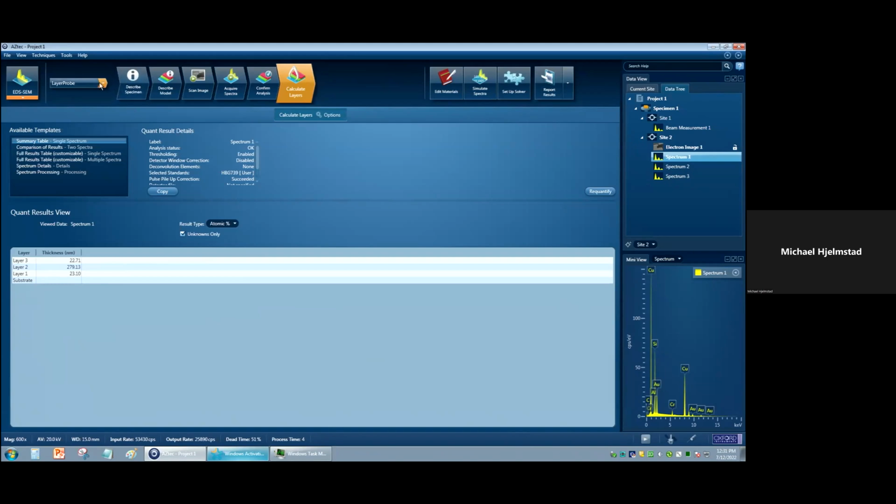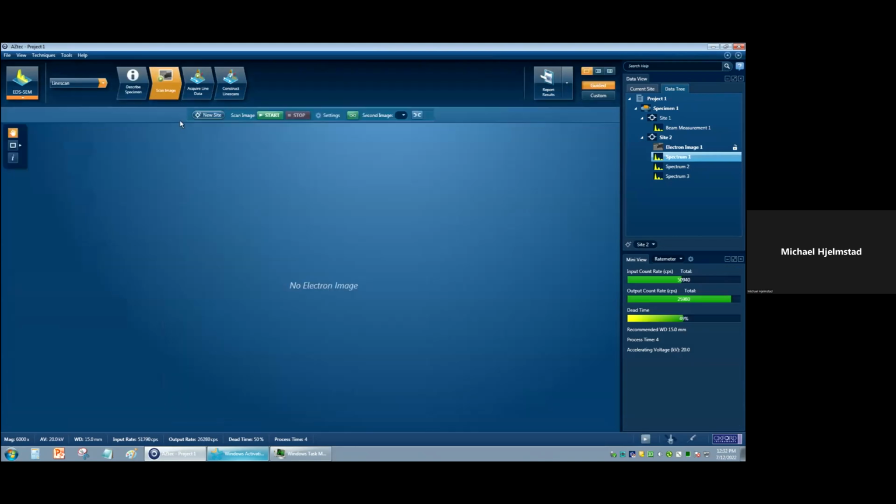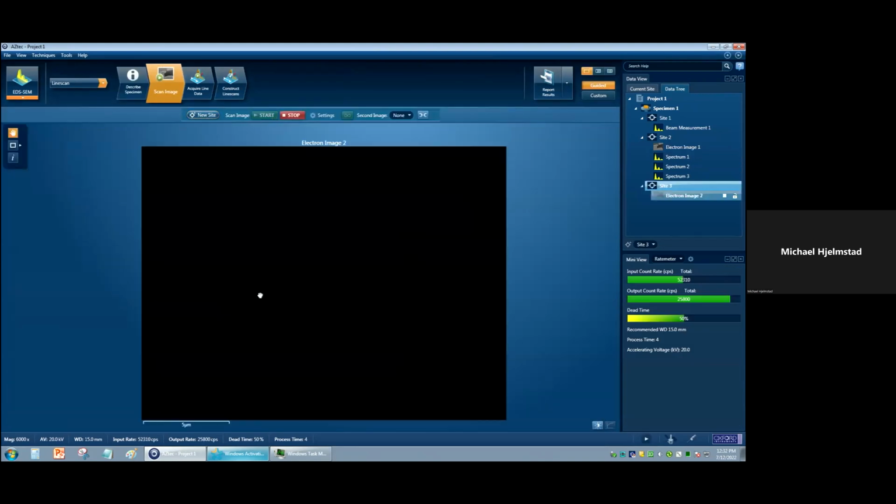What you can do is go to a completely different region on the sample. And keep in mind, someone asked a great question earlier about magnification. If I go to too low of a magnification, like the corner of this film, then I'm not helping myself, because I'll lose geometry of the detector and it might not be right. But here's an example of something I do. This is now at 6000x. I'm going to come over here and use the line scan, and I'm just going to grab a new site.